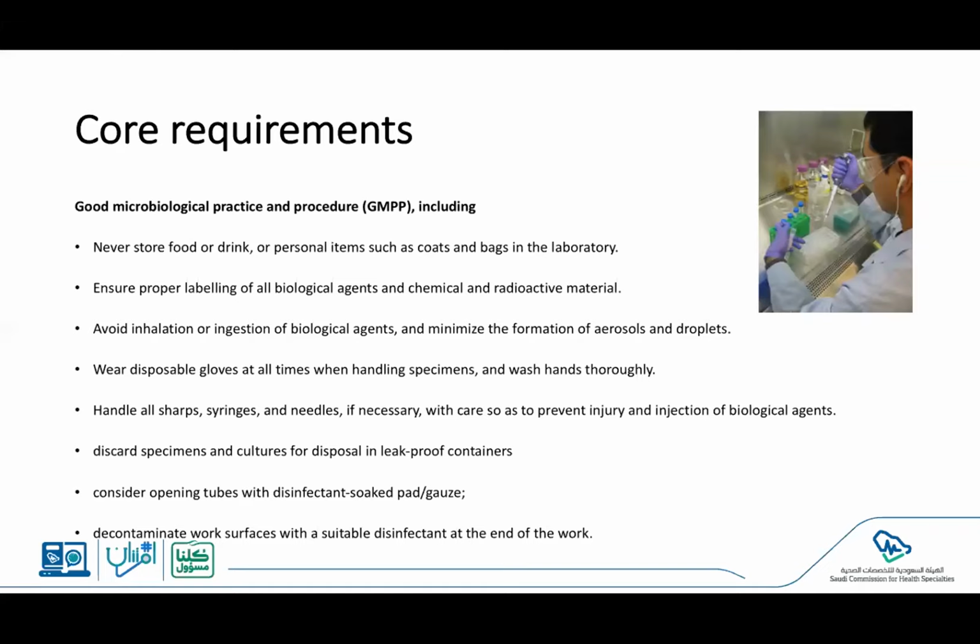When we are opening the specimens, we probably need to consider opening them inside a biosafety cabinet, or by using gauze that is soaked with disinfectant. And of course, we need to maintain the hygiene of the surface by disinfecting after every manipulation.